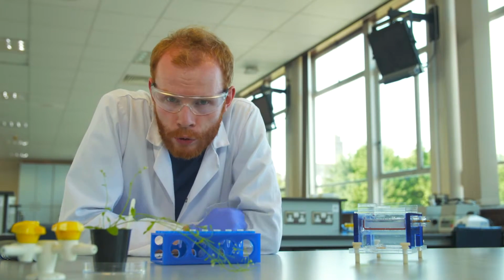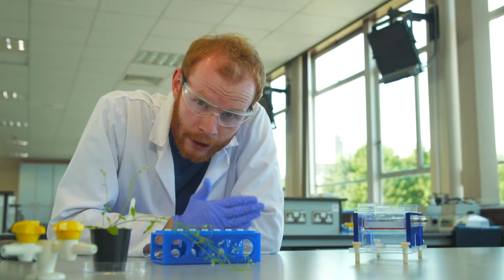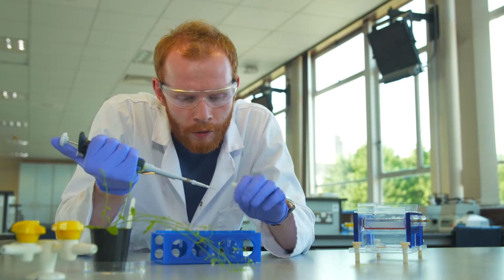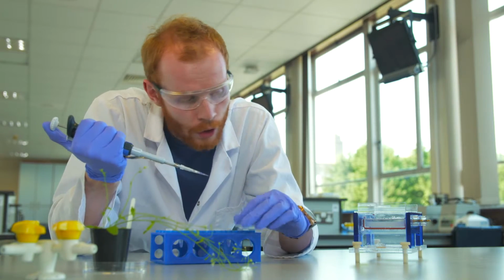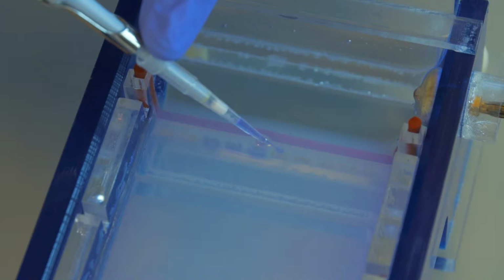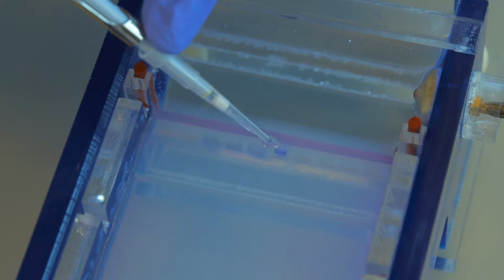In these tubes I have some DNA samples from plants which may or may not contain my mutation. What I need to do is add a small volume of each DNA sample to a well in my gel. And then apply an electric charge.